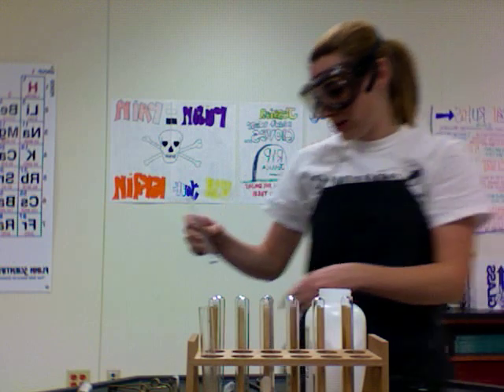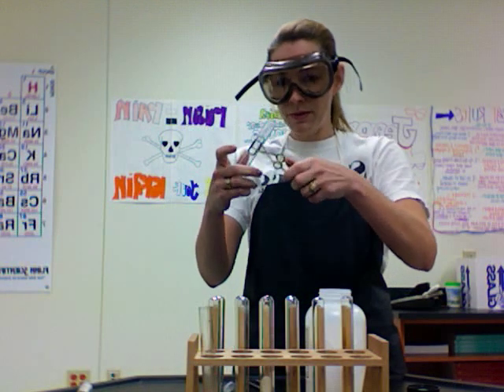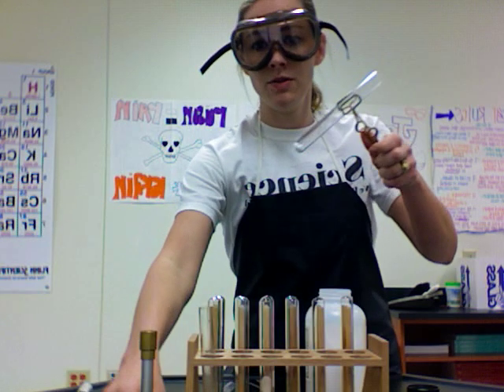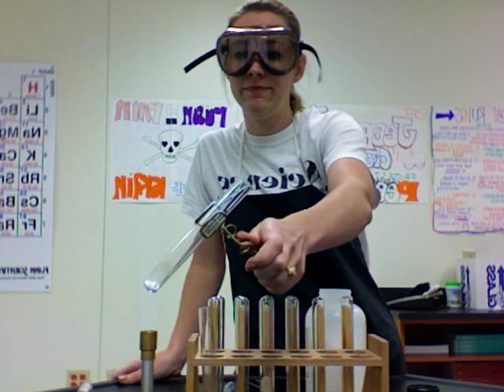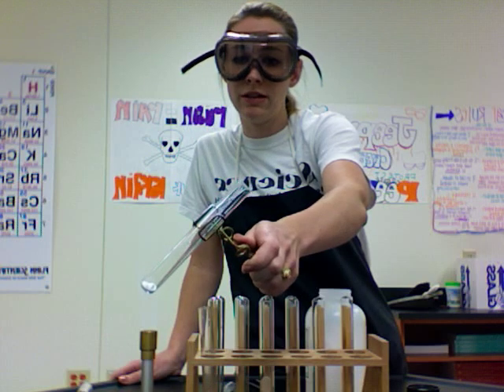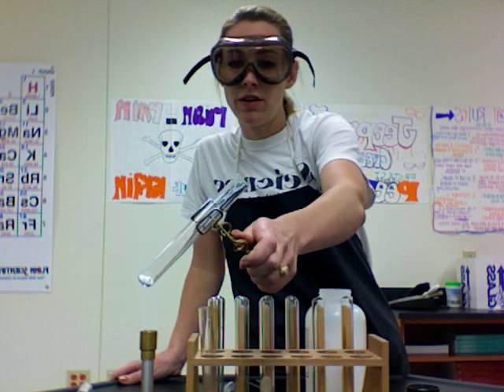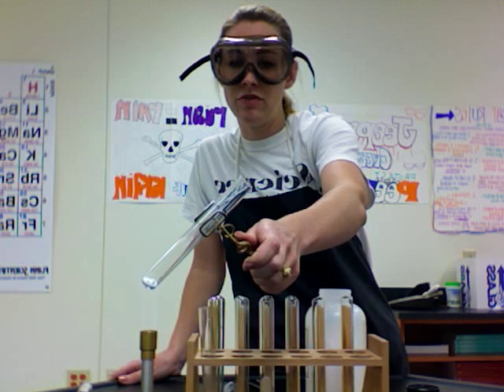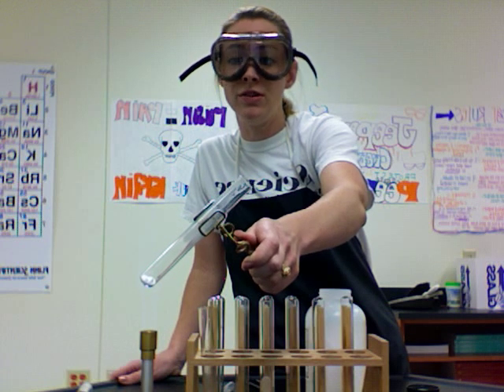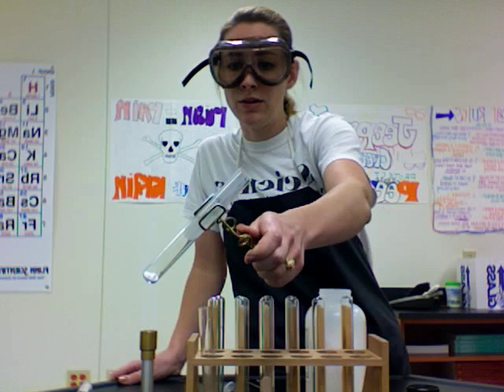Now we're going to take it and we just need to encourage the decomposition a little bit. I'm going to put it in my test tube tongs and just heat it over the fire. We'll know when the reaction is going because it will start to smell really, really bad. One of the products of the decomposition of ammonium carbonate is ammonia gas, which is the main smelly component in cat pee.